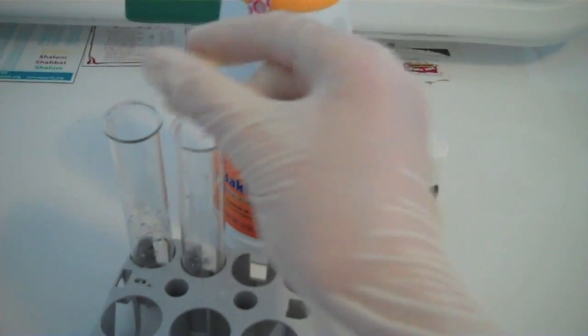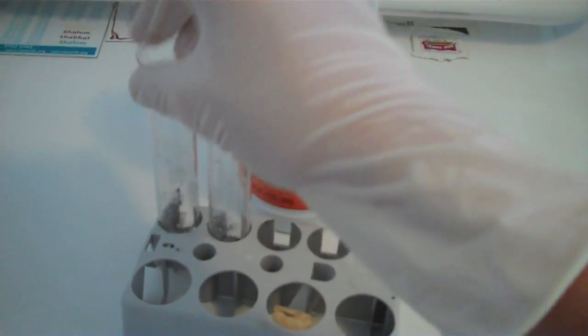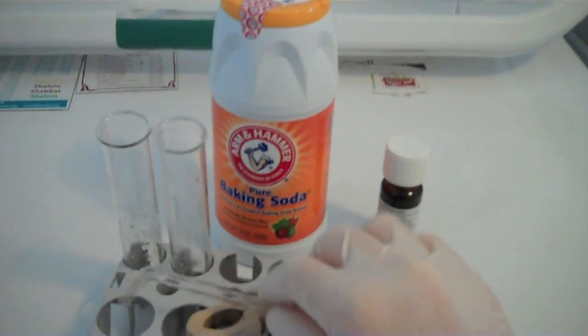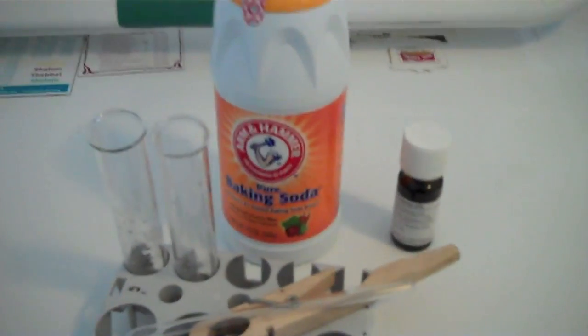A cork with a hole in it to fit the test tube, or it could be a rubber stopper with a hole in it, a test tube clamp, and a glass angle tube.